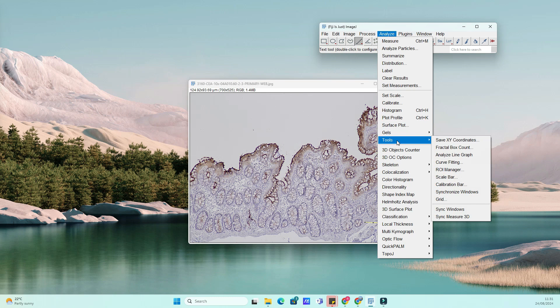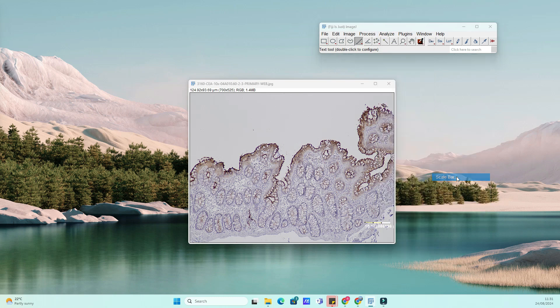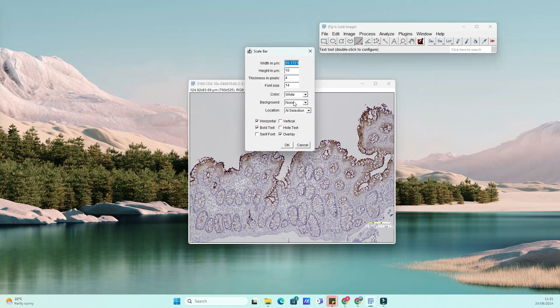Now, enter the known distance in the Known Distance field. Set the unit of length — for example, micrometers (µm), millimeters (mm), or whatever applies to your image. Click OK when you're done.